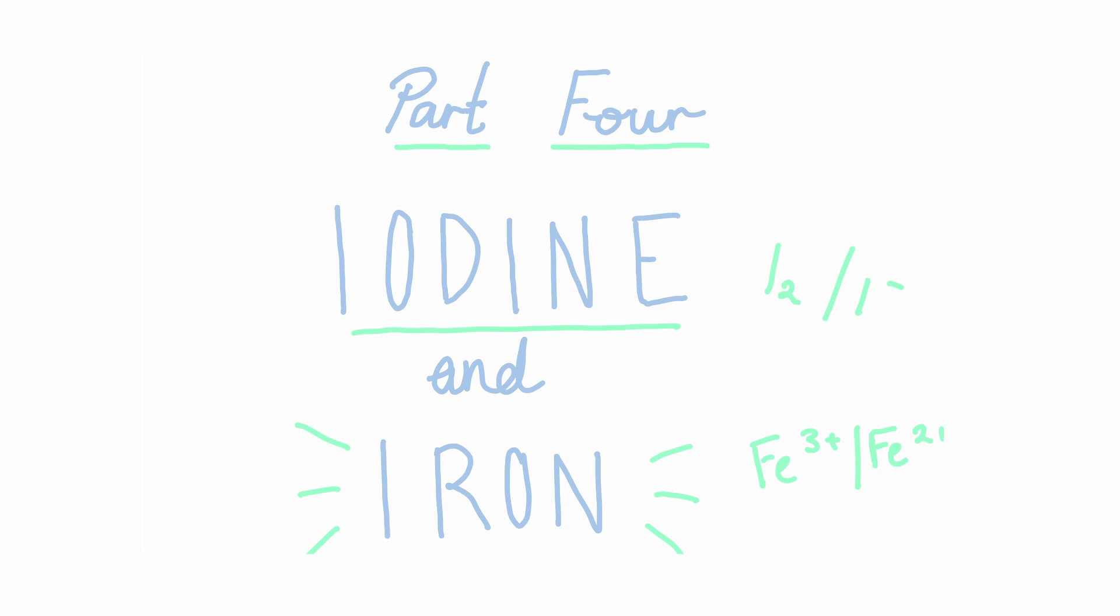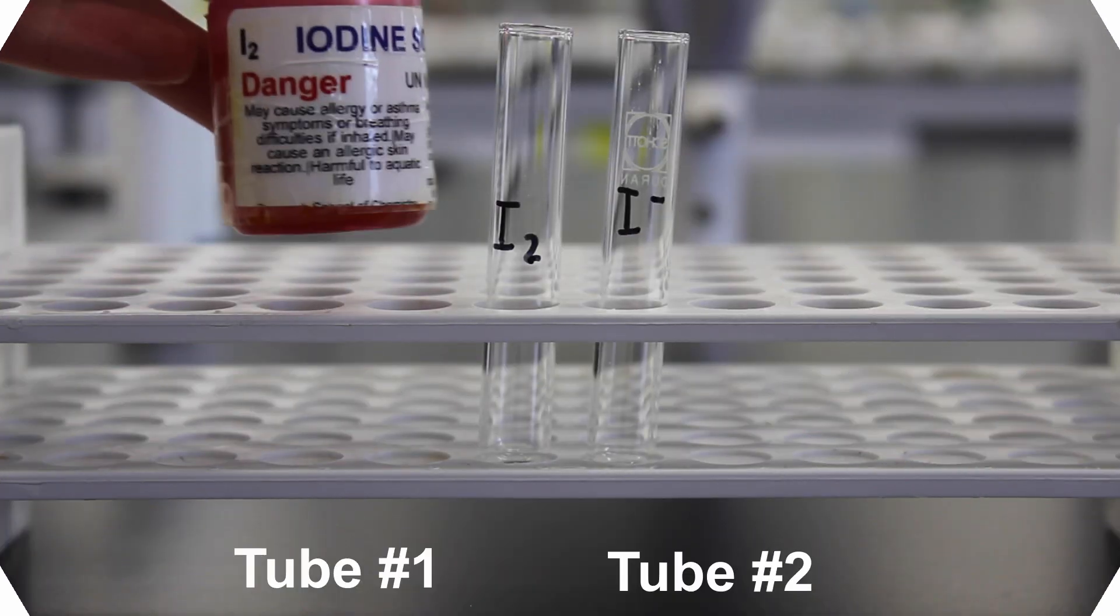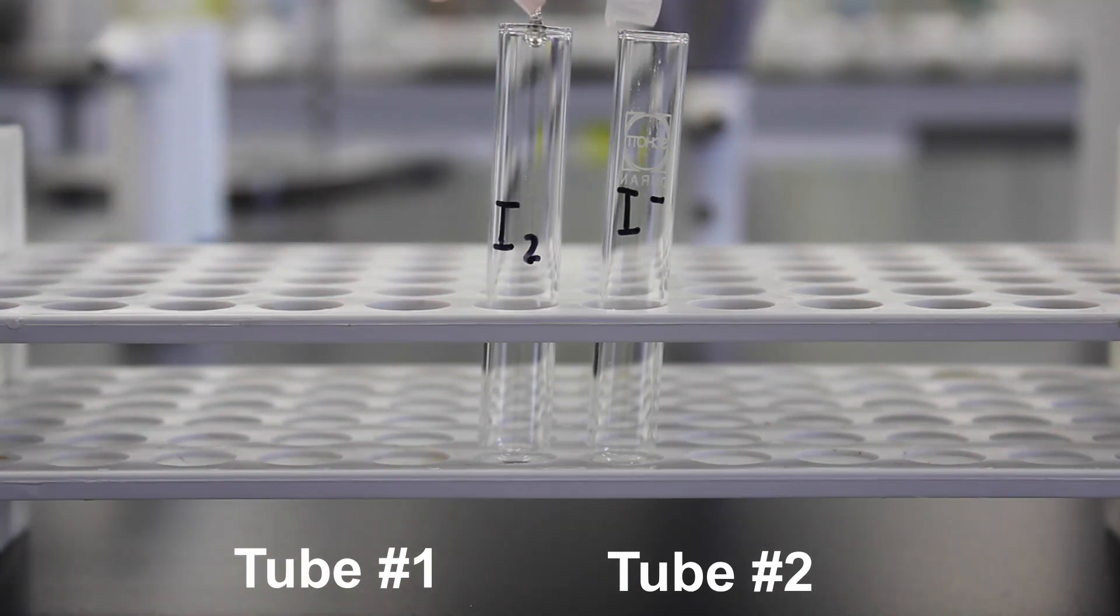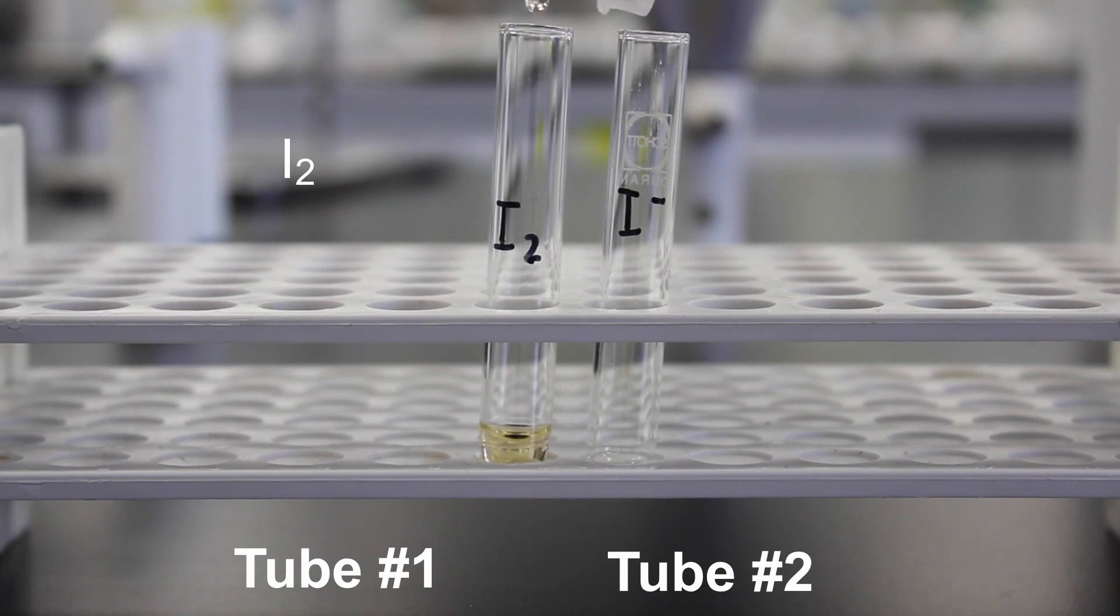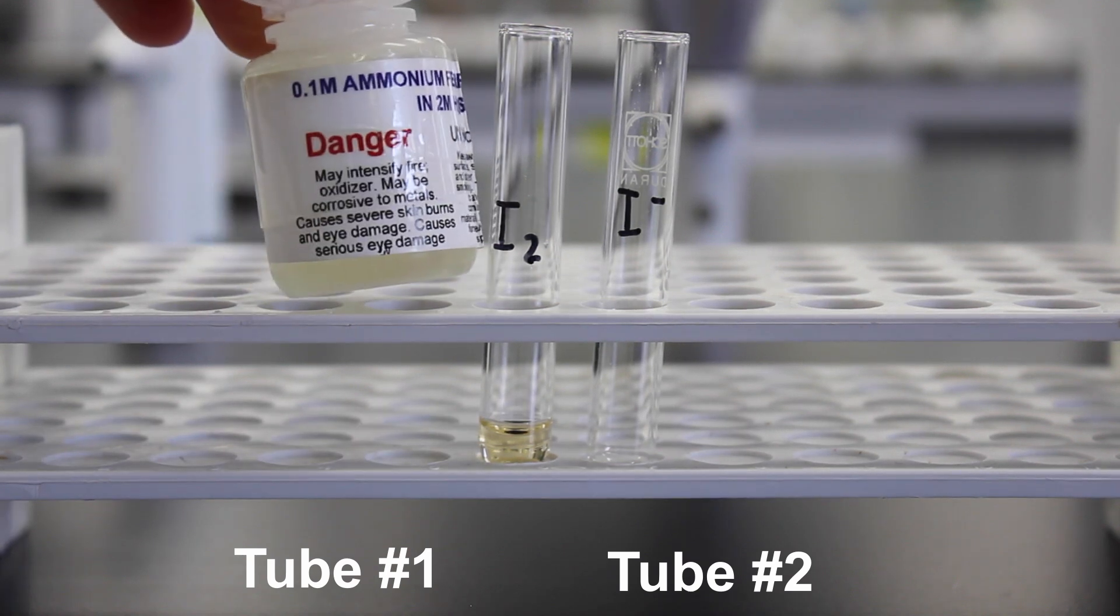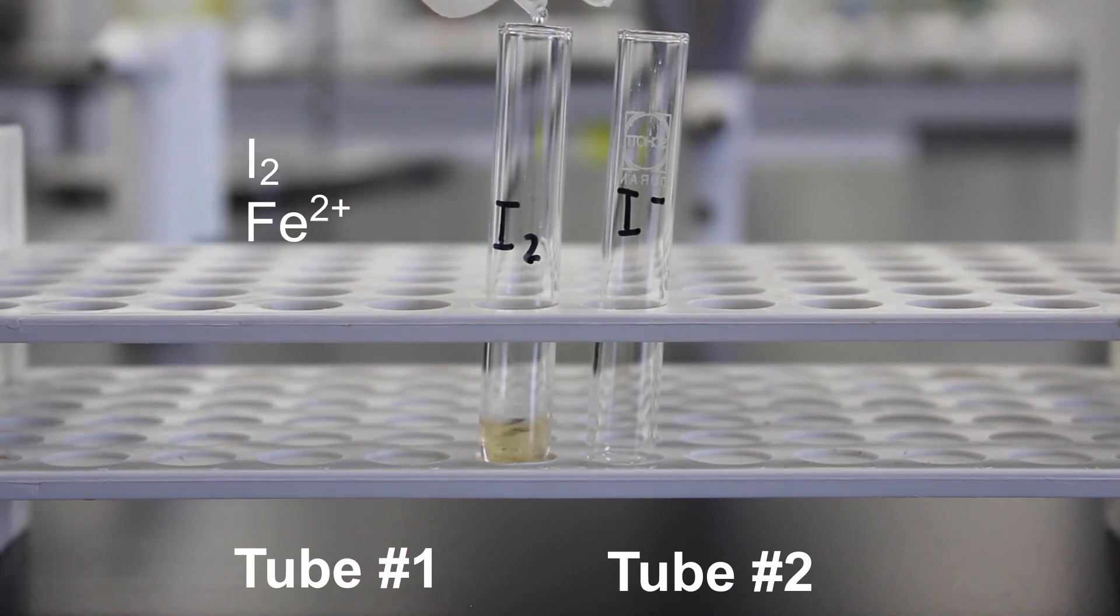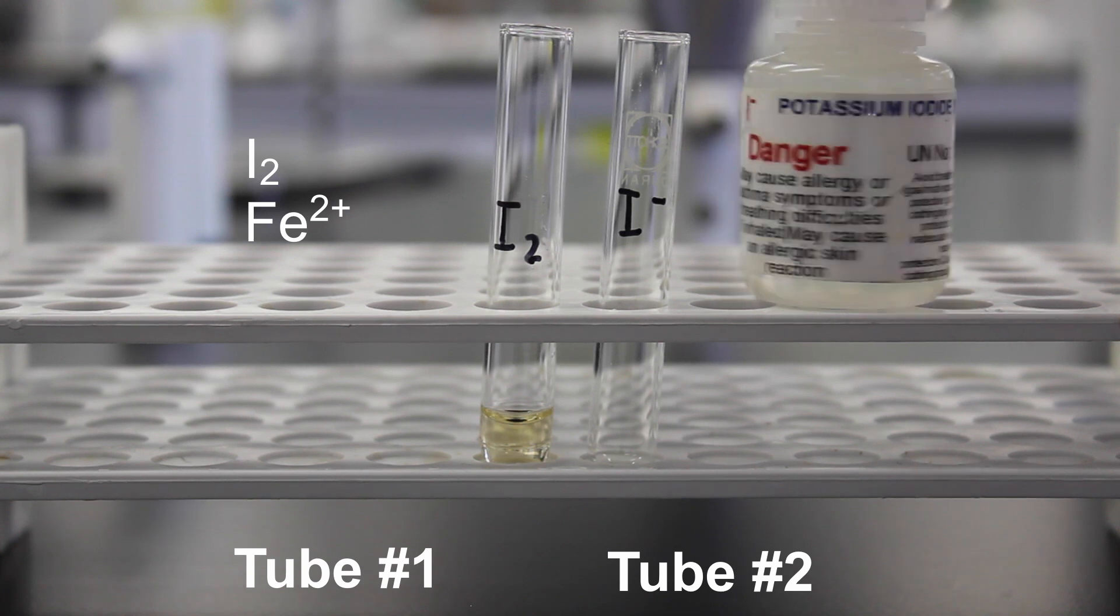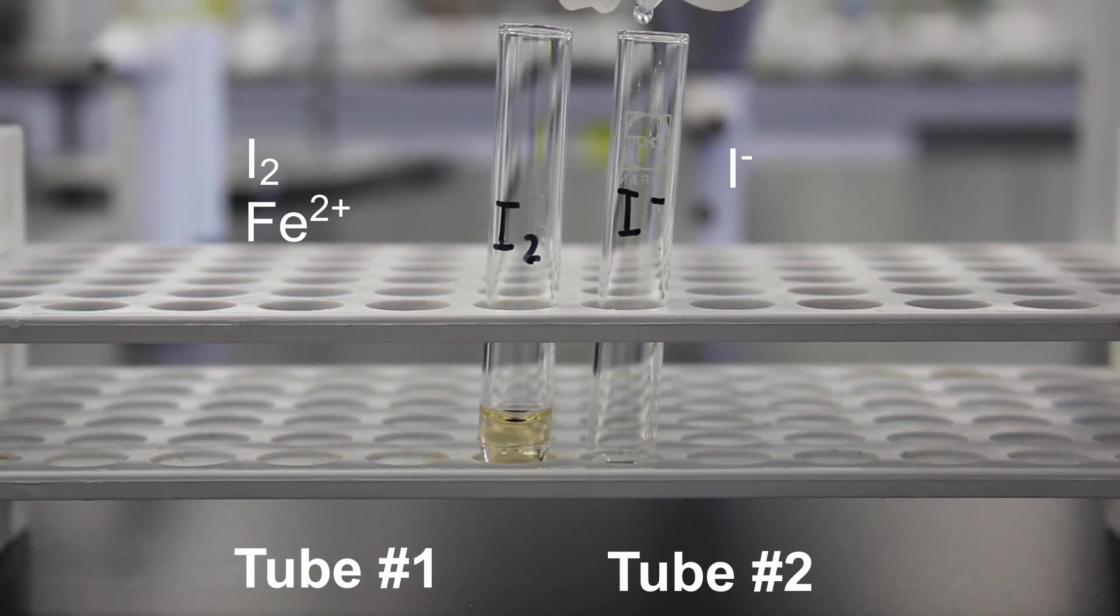In part 4, we'll compare the electrochemical couples of iodine and iron. To your first test tube, add your free iodine solution, I2. Now we'll add iron 2+. To the second test tube, add your iodide ions. Follow this with a few drops of iron 3+.